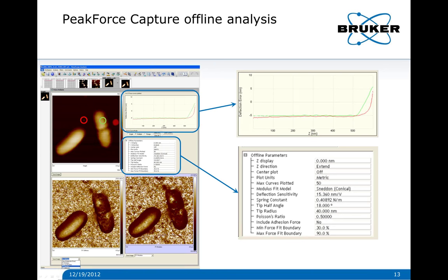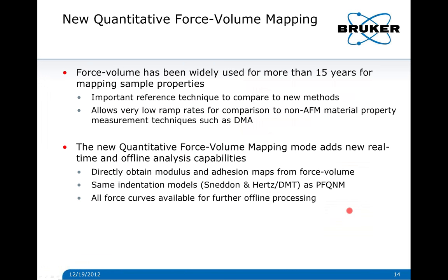Here's an example offline looking at peak force capture data for the same two bacteria. We have all of the curves — you can click anywhere on this image and see the curves at that point. This gives us opportunities: we can directly test the model, look at different models, and export these curves. You can also adjust the calibration parameters after the data has been captured — if you find out afterwards that your deflection sensitivity, spring constant, tip radius, or whatever was wrong, you can correct that. This makes it much easier to do comparisons between peak force QNM and other techniques such as force volume.